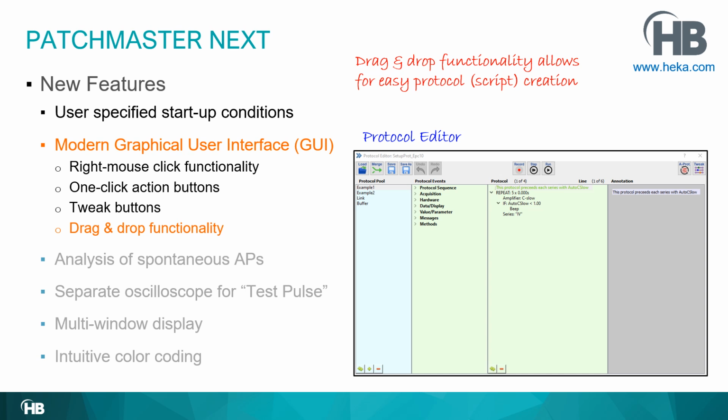So to do this, all you need to do is you go on the Save As button, you click on it, and you give the file a name, and then you save it. And now every change that you would make is being saved to the support file with the name Frank.